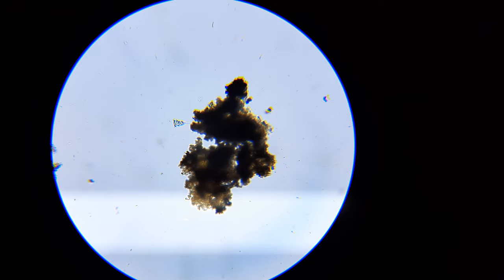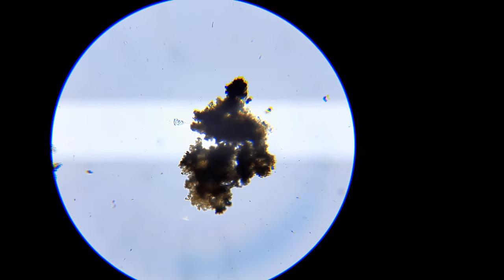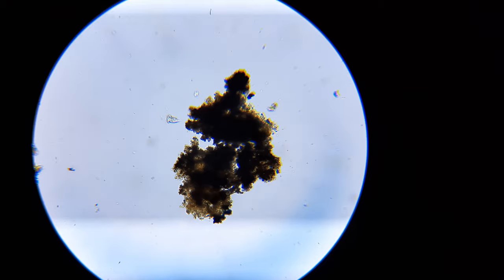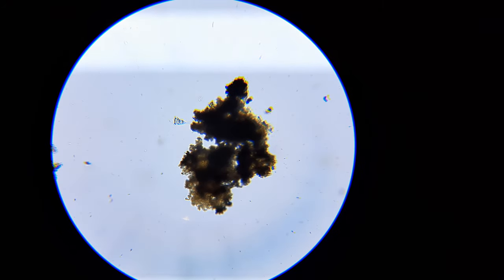So in this case it'd be half of that, about 833 microseconds of on-time for the LED. That enables you to get that stop-action effect on the cilia.